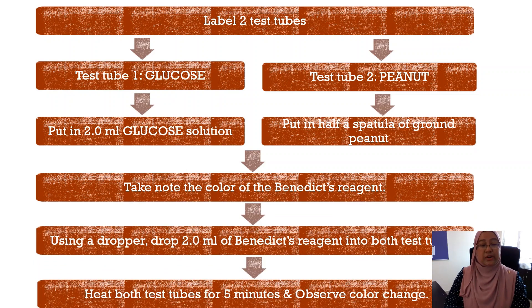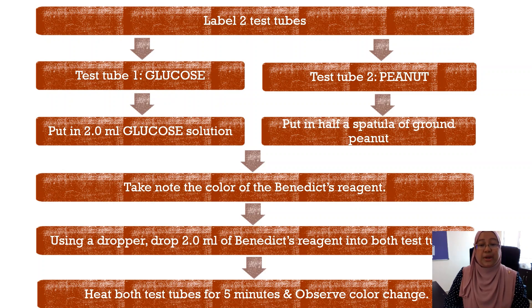This procedure is performed to determine the presence of reducing sugar. Label two test tubes: test tube one for glucose, test tube two for peanut. In test tube one, put in 2 ml of glucose solution; in test tube two, put in half a spatula of ground peanut. Take note of the color of the Benedict's reagent, then using a dropper, add 2 ml of Benedict's reagent into both test tubes. Heat both test tubes for five minutes and observe any color changes.